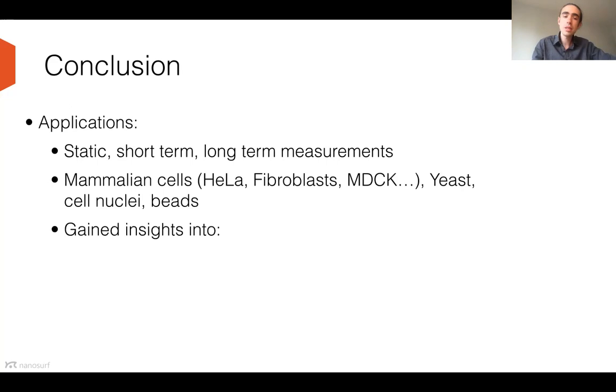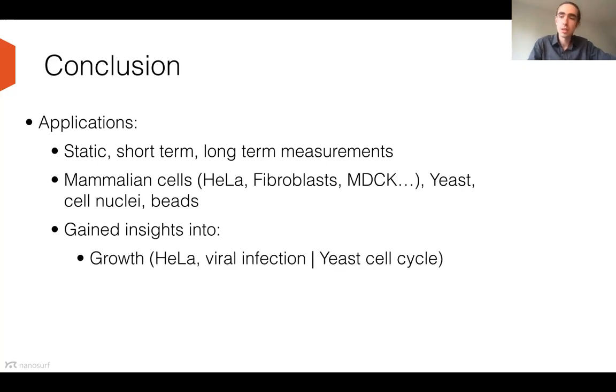We gained insight into growth, in this case in the long-term measurements for the HeLa cells. We saw how healthy cells grow and how virally infected cells do not grow anymore. We have also seen, although I didn't discuss that too much because the manuscript is still in preparation, how the yeast cell cycle affects the cell growth of yeast.